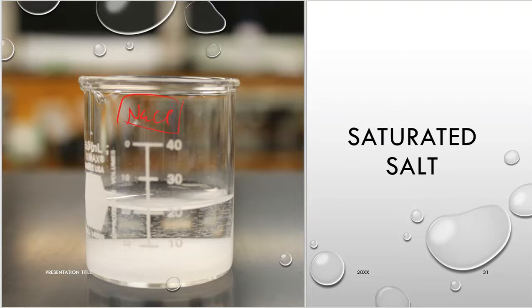And saturated solutions are very easy. So I take just a little bit of water. Here you can see about 20 mL of water in total. And I just keep adding salt to it until the salt doesn't dissolve anymore. And you see that here on the bottom of the beaker. So when no more salt is getting dissolved, that is a saturated solution because it doesn't dissolve any more of it, and that is it.